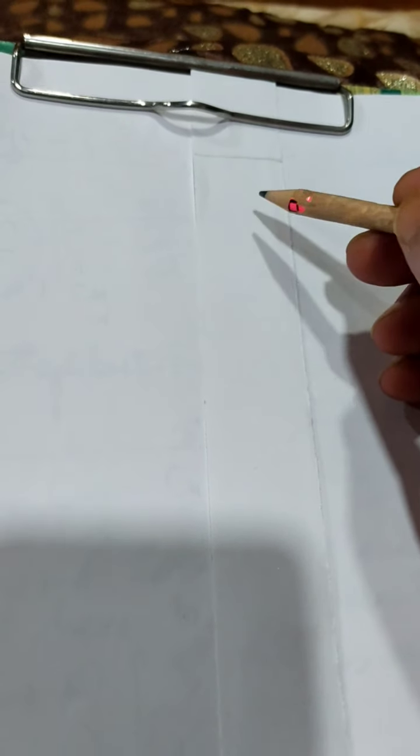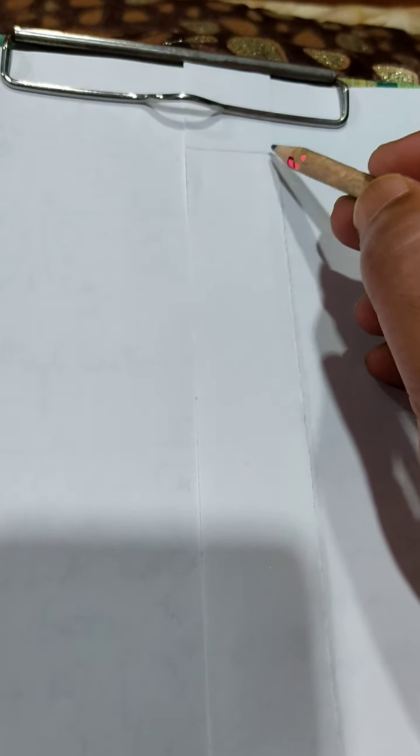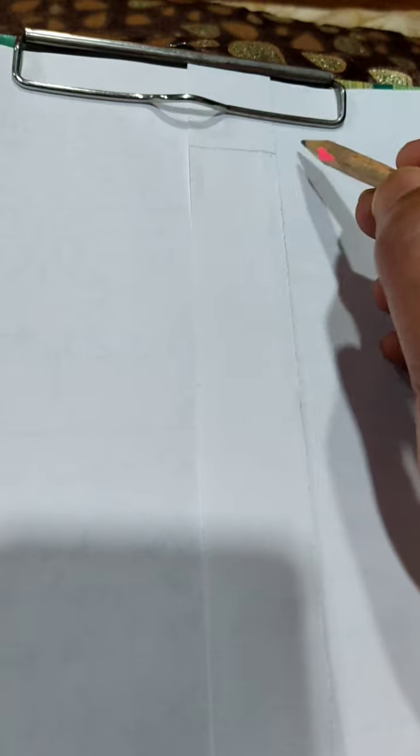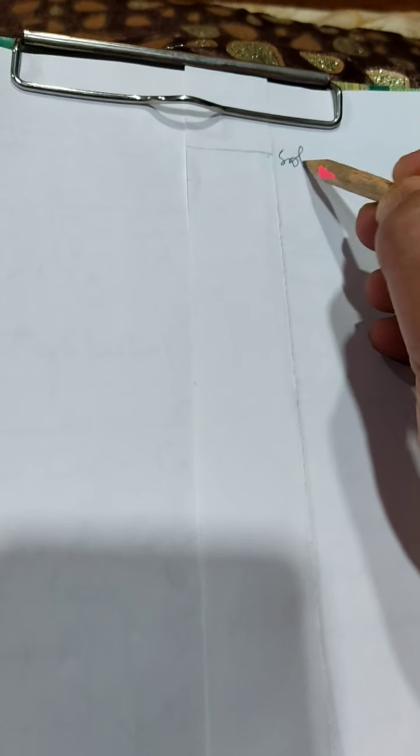Then we take it out and dry it, and we mark the place up to which the solvent has ascended. This is called the solvent front. And this is called the baseline.